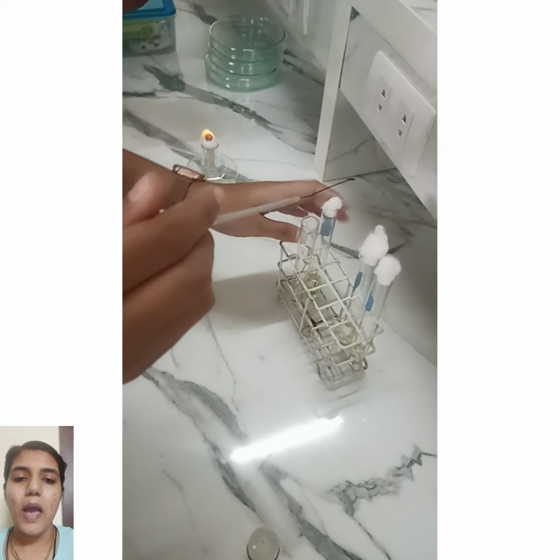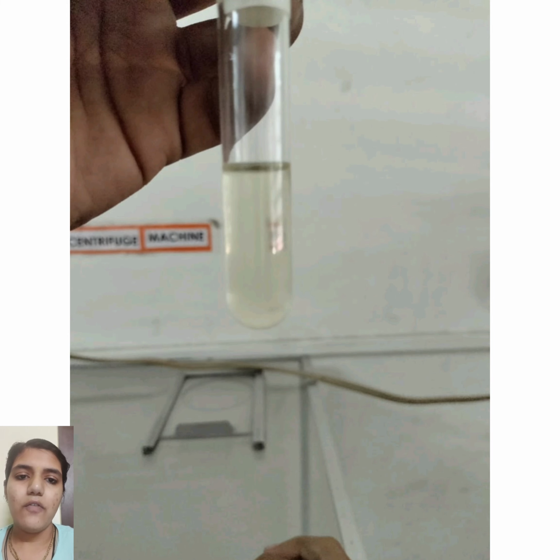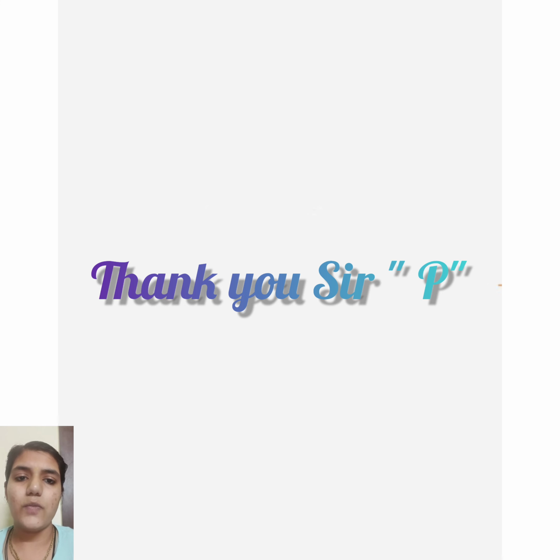We need to perform the same activity 3 times, once per test tube that contains nutrient broth, and this technique is called aseptic technique, which we follow to prevent contamination while performing any experiment in the laboratory.